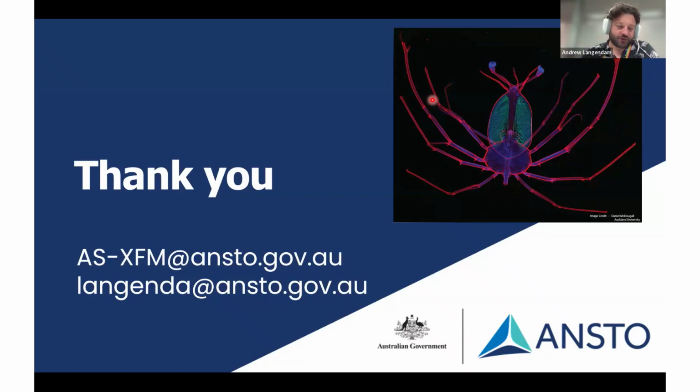Yeah, great question. This is a question we often get. Your polish for an XFM thin section doesn't need to be as high as it needs to be for SEM. So if you're already preparing your samples for SEM, then you're more polished than you would ever need to be for XFM. In fact, we can take samples that are mostly just straight off a rock saw. There are some caveats with that. You'll see a bit of the texture of the saw. But you don't have to be extremely well polished to run something at XFM.